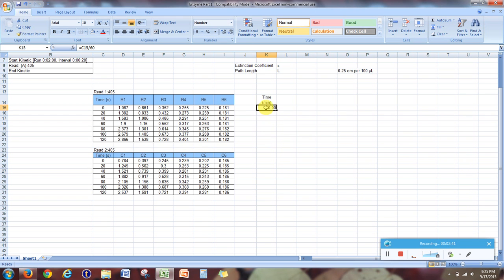And you can go copy, you can paste it. One trick you can do is pick up this little black square in the lower right corner and then just drag down. And as you can see, it copied everything. The formula changed as we copied, and 120 seconds would be 2 minutes. You can always double click on a cell to view the formula and make sure it's pointing at what you expect. And to get out of this, just hit the enter key without messing it up.